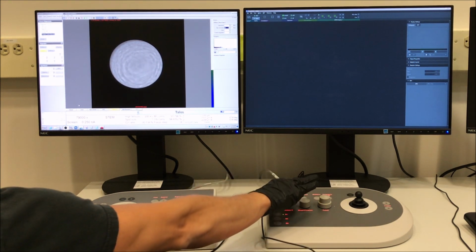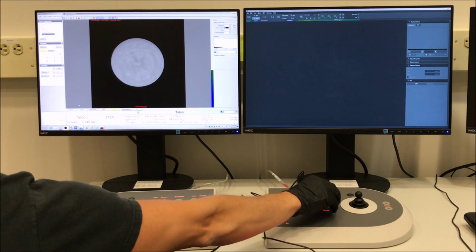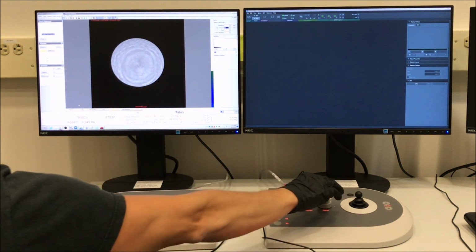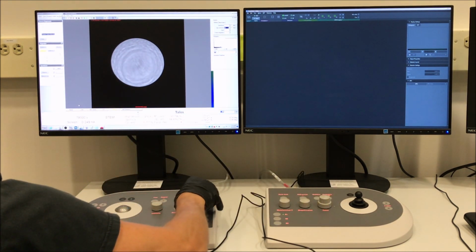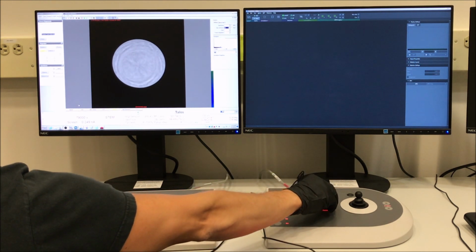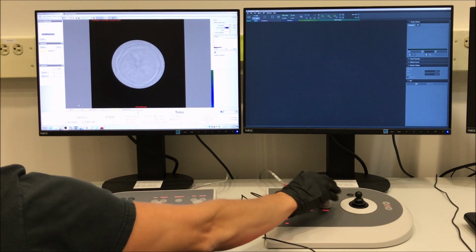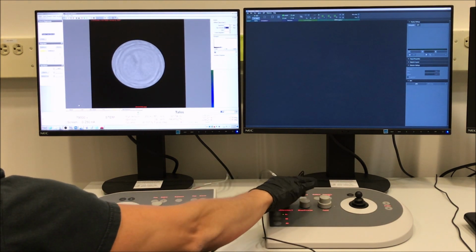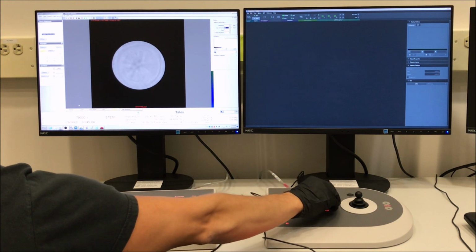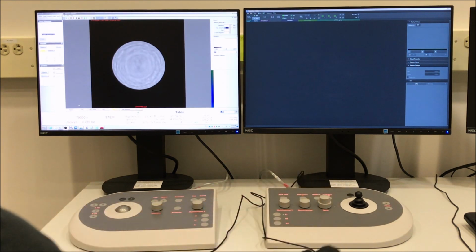And again, what I'm looking for here is, as I adjust the focus and expand and contract the Ronchigram, is it expanding concentrically? So you can see it's kind of expanding down and to the right. So again, I'm going to set my adjustment for my multifunctions on the lowest setting. Just hit that fine button above the left knob a couple times, and then adjust my knobs. Then check with the focus to see how it's expanding. Then adjust the knobs, check with the focus, so it's iterative until it's going straight in and out.